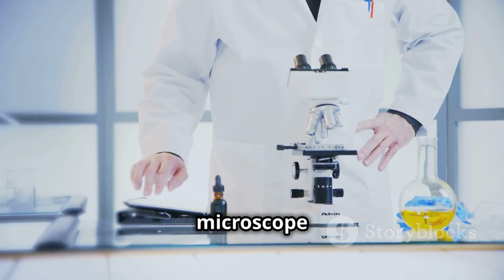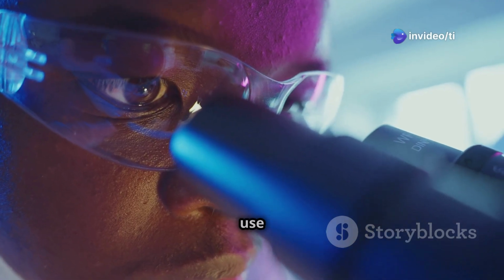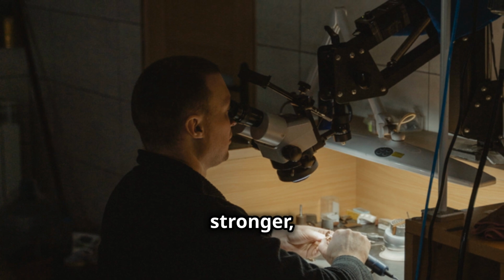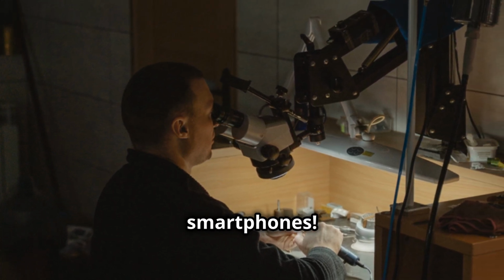But the reach of the microscope goes far beyond the medical field. In material science, engineers use microscopes to examine the structure of materials at the microscopic level. This helps them develop stronger, lighter, and more durable materials for buildings, airplanes, and even smartphones.